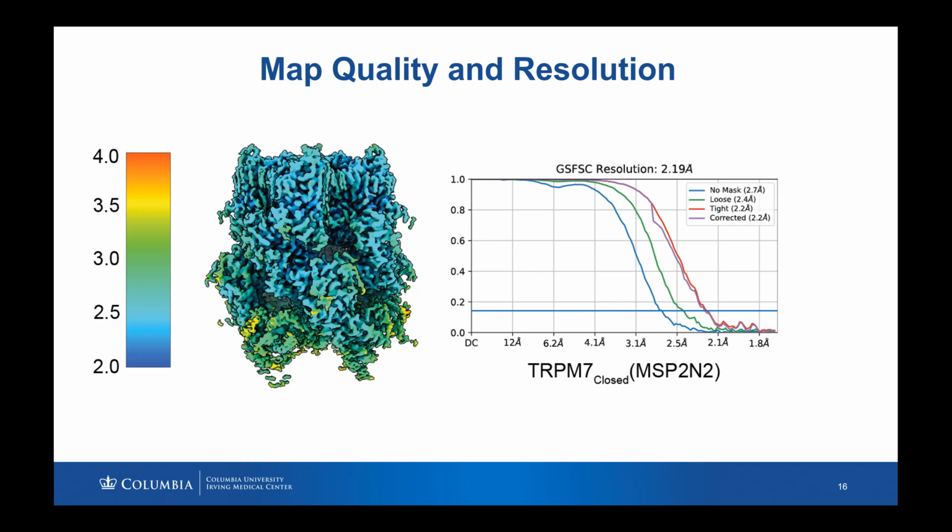The first idea was, okay, the structure was already solved with a truncated version by that time. So what can we do? Why not try to do the full length with the kinase domain? I spent a lot of time doing this, and the yield was so low, basically there was no yield. So it was not feasible to get any Cryo-EM data from that.